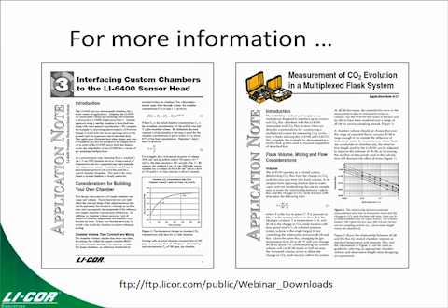And if you're just subsampling using the analyzers, you can just take a small amount of air out of the chamber. But to do that sort of thing, you would need to look at application note number 2, which provides more details on those. That's an excellent point, Pat.